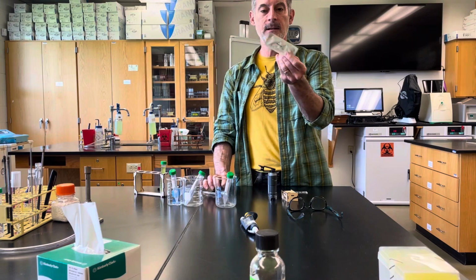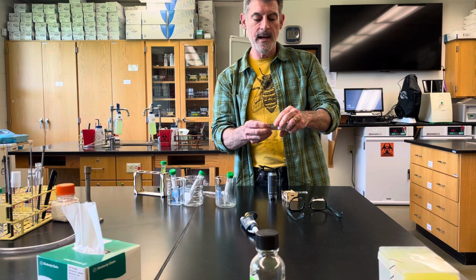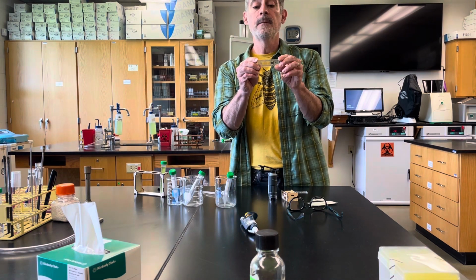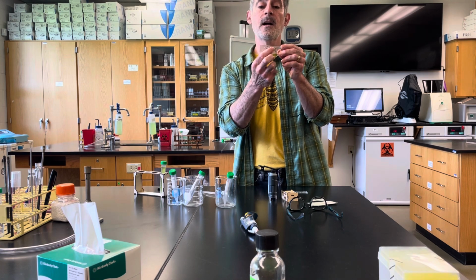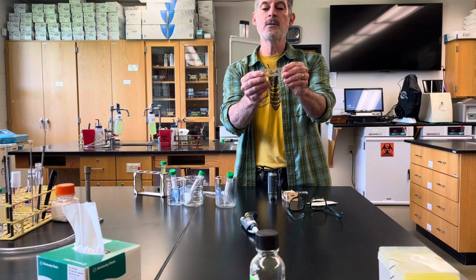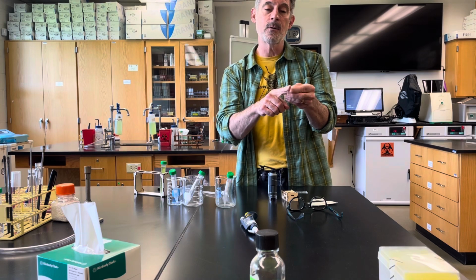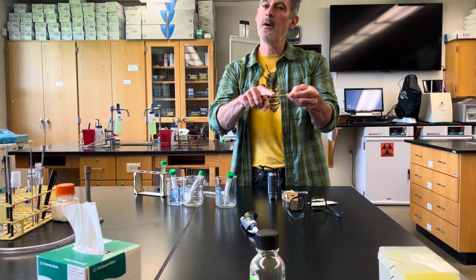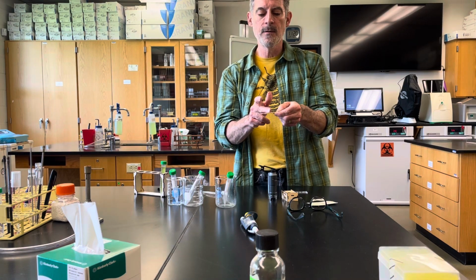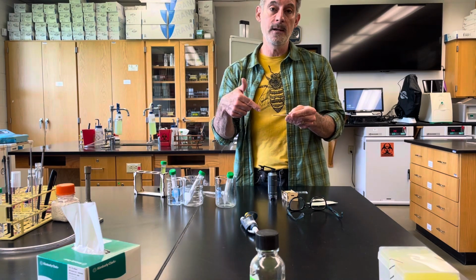You should have in your kit a little container like this. Inside it is a slide. It's a counting slide. And the slide already has a little cover slip attached to the surface. There is a top and bottom. There's an A and B on it. Make sure that when you're looking at it, the A you wouldn't see as backwards, but the B you would see as backwards. Also, if you run your finger across it and it's perfectly smooth, that's the bottom of this. You need to turn it around. If you run your finger over and you're like, oh, there are little grooves in there, there are little openings, that's where the liquid will go in.